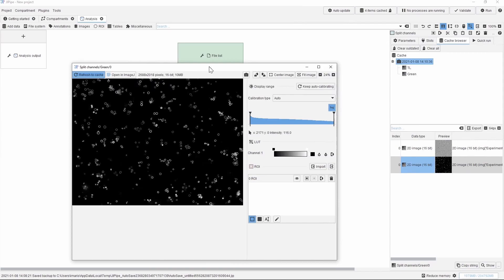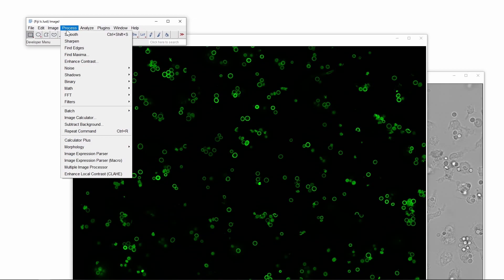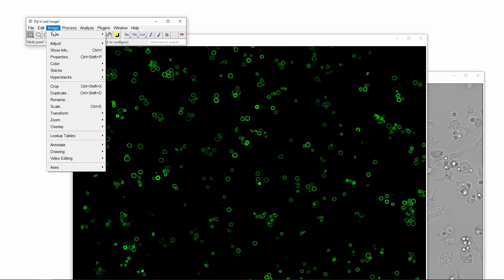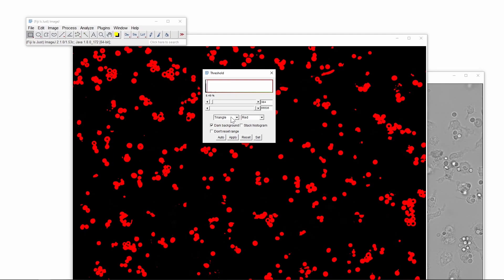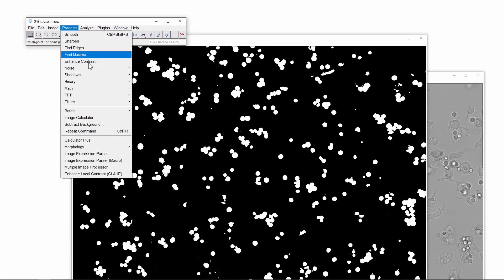Now let's continue with the extraction of the green spores in ImageJ. We start the processing with the background correction using the rolling ball method with a 22 pixel radius. And then we continue with global thresholding. Here we will choose the triangle method and then we apply it. In the threshold image then we want to remove the remaining holes from the objects. And then in order to separate the touching spores we will use a classical watershed algorithm.